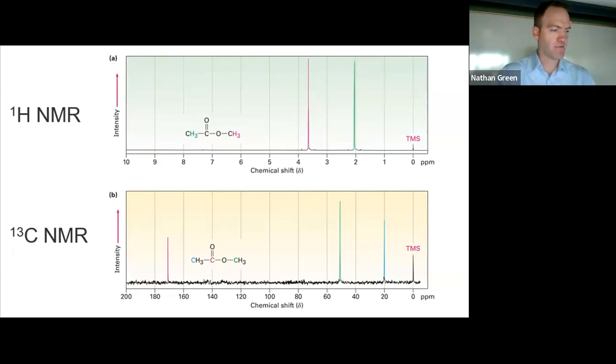If I knew the molecular formula and just this proton NMR, I can tell you this entire structure. So that's what we're going to endeavor to do: I'm going to give you a molecular formula and just the proton NMR, and you're going to build the rest of this in. So we don't talk about carbon NMR more than this because it's extremely limited in what you can get from it. Carbon NMR tells you only chemical shift.